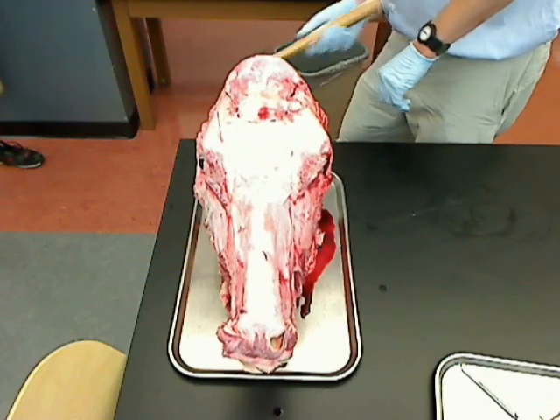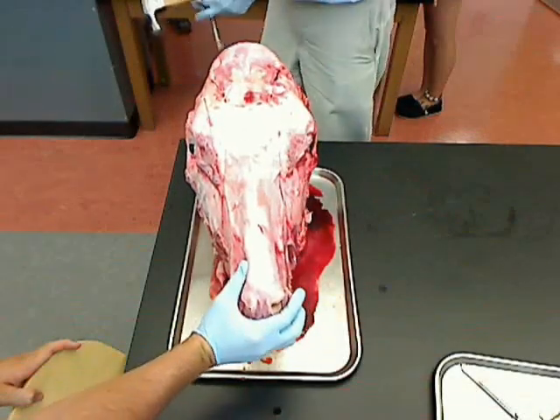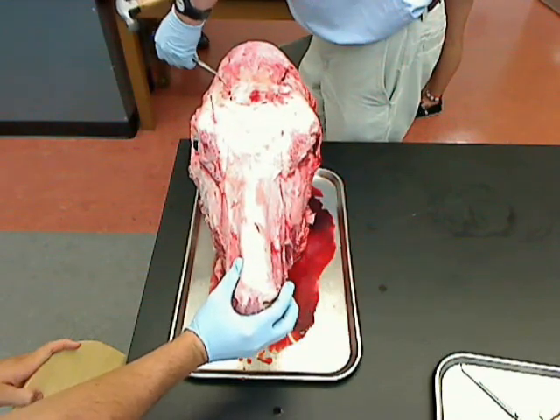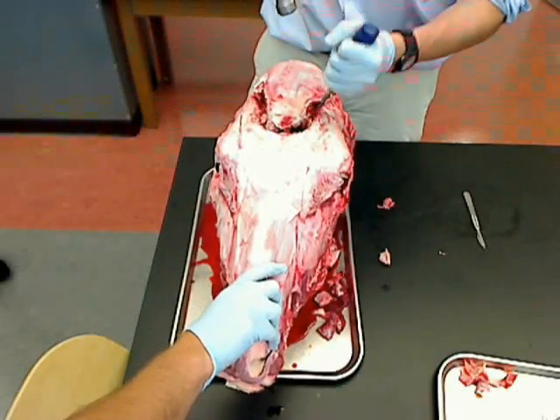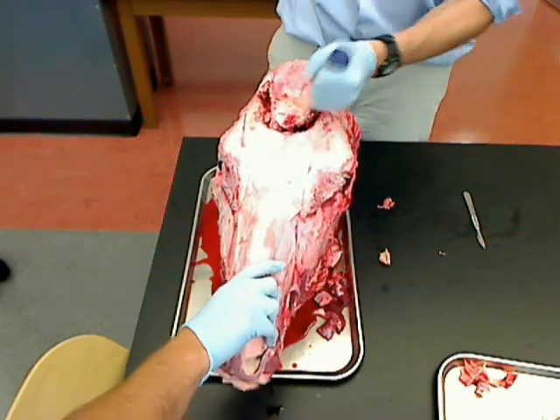Occipital condyle, occipital condyle — and that's down here.